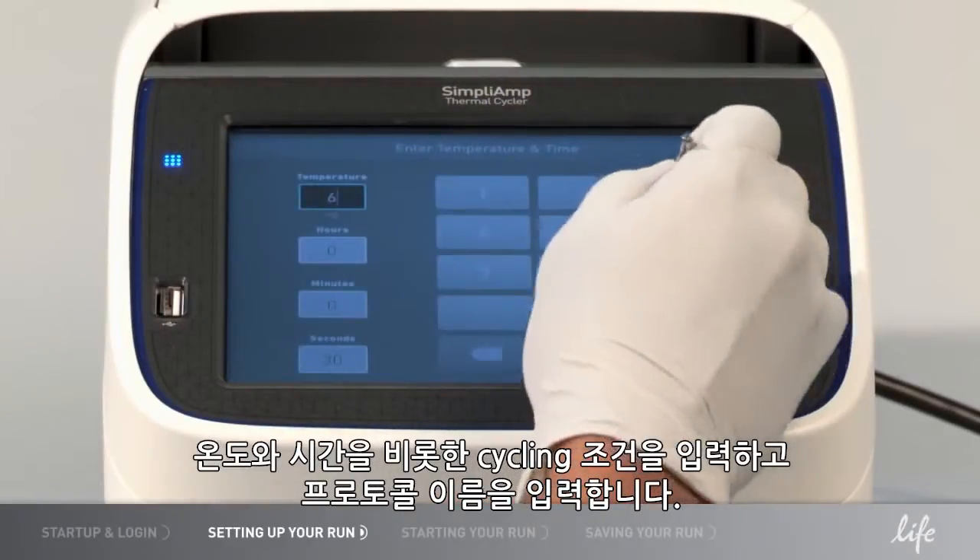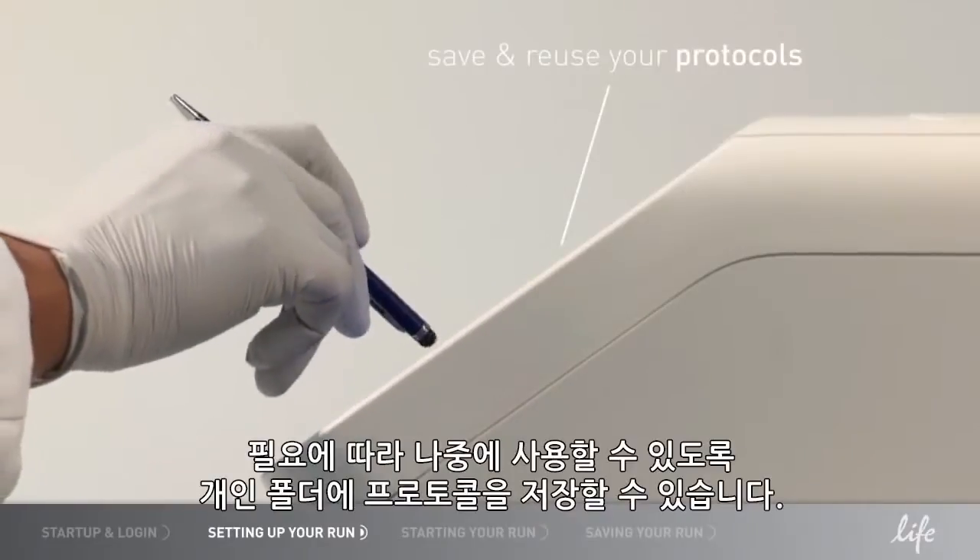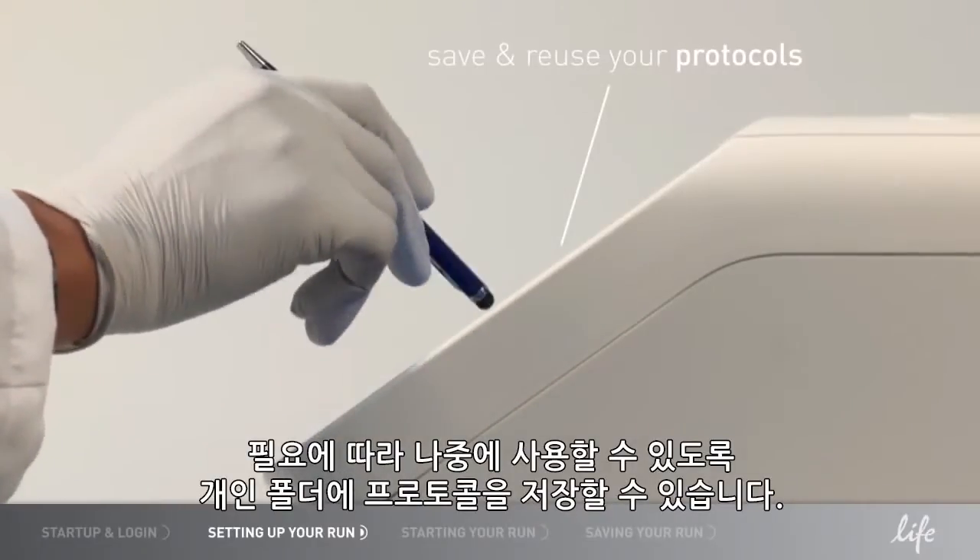Enter your cycling conditions, including temperatures and times, and enter a name for your protocol. If you would like, you can save the protocol in your personal folder for future use.